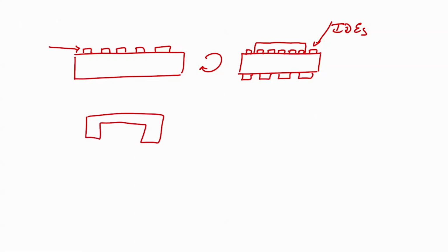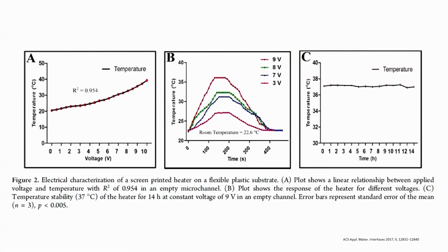So, this is the channel that is created, and then you first load the antibodies, then you load the blood, then you capture the bacteria. After you load the blood, you have to incubate it, wash it with PBS, capture the bacteria, then add antibiotic with growth media and look at the change in the electrical property, that is your impedance.